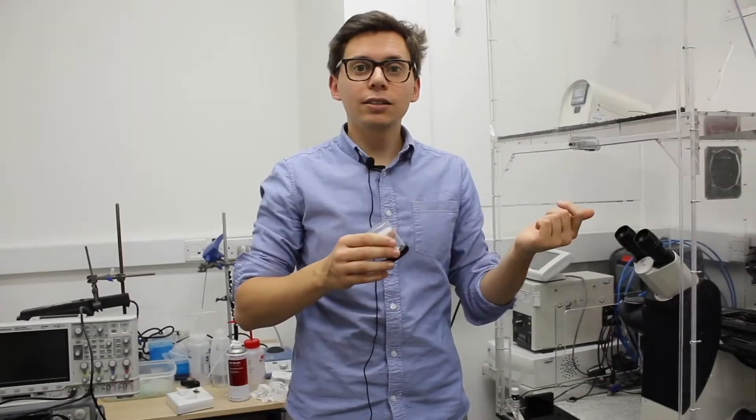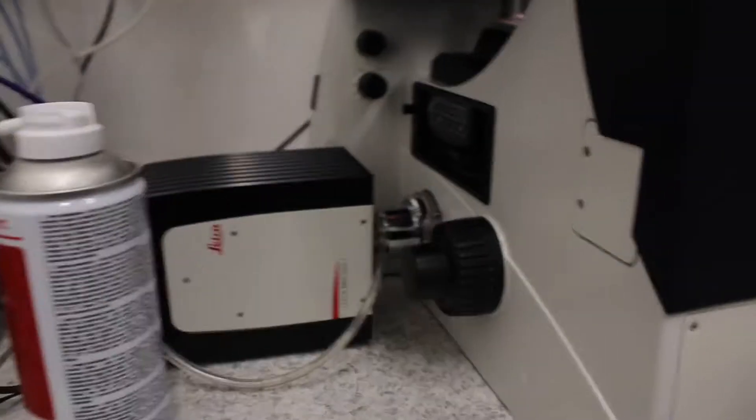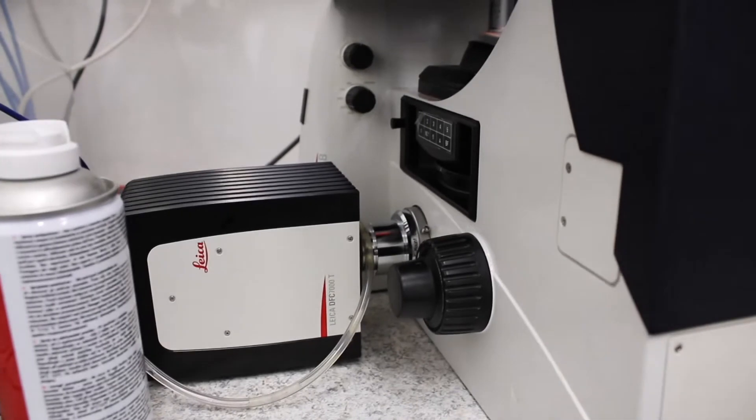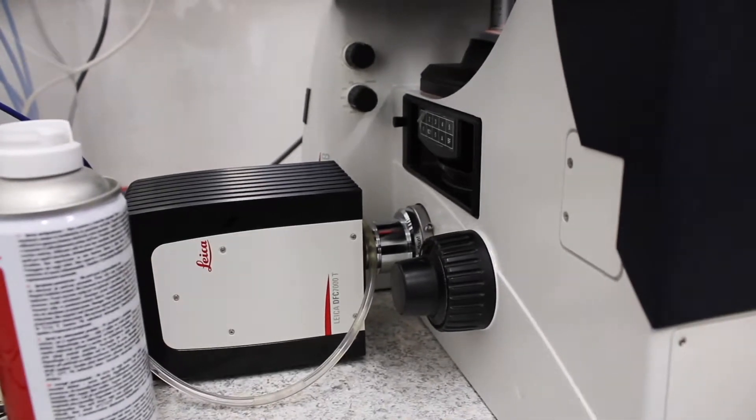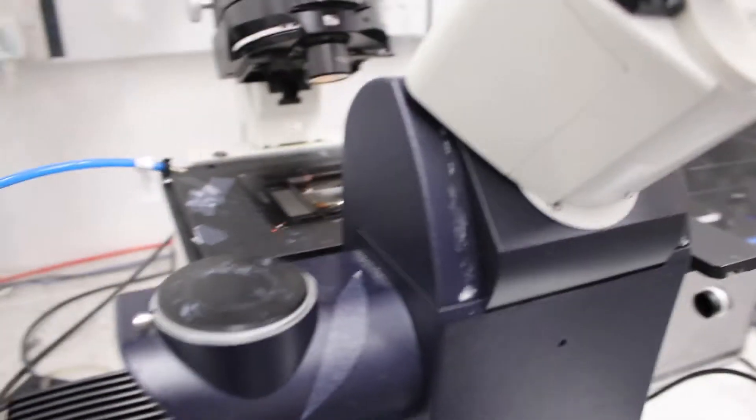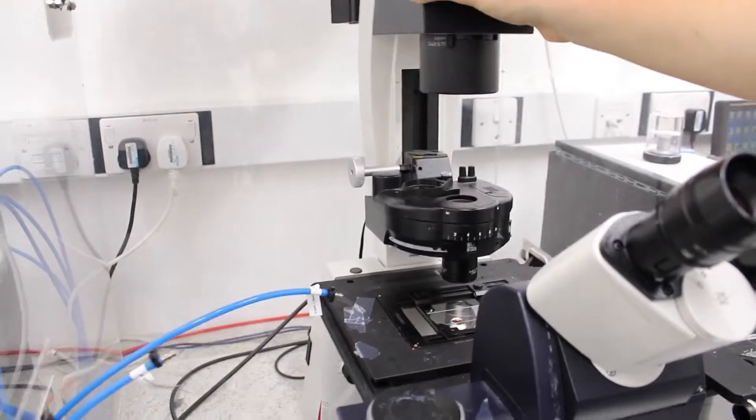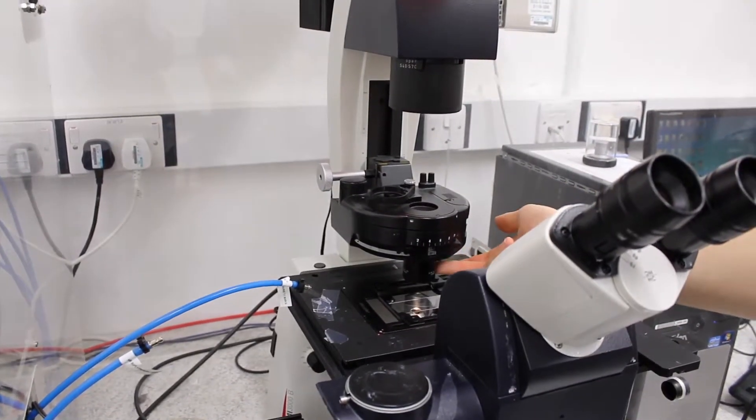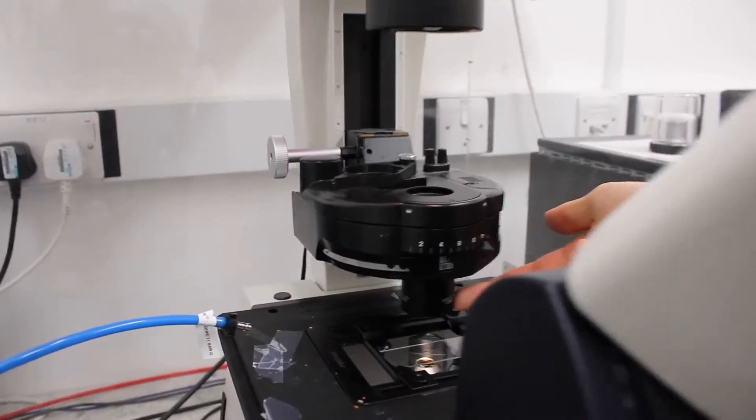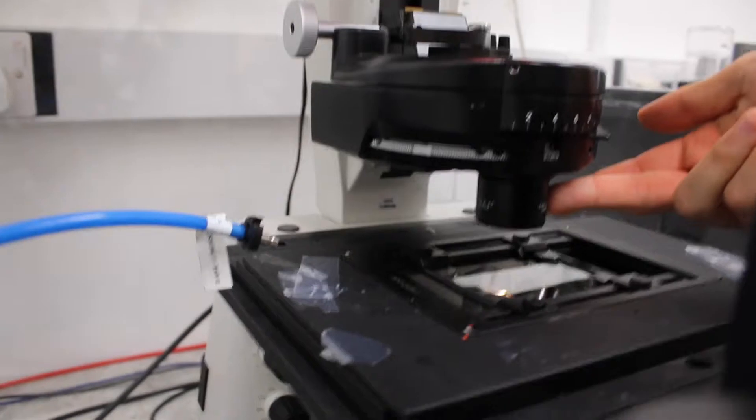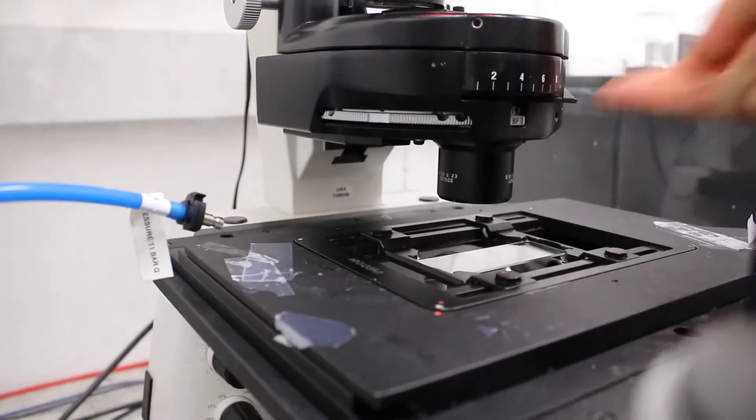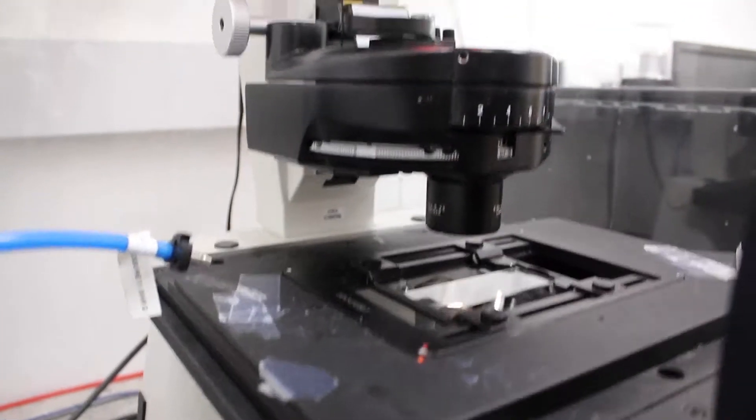Try to change the objective back after your session, so that future users are not confused about the objectives that are on. So you have chosen your objective, you can load your sample, and then you can put that arm back in position. And then there is a condenser lens here, an additional lens, that has to be on if you are using objective 10 or more.